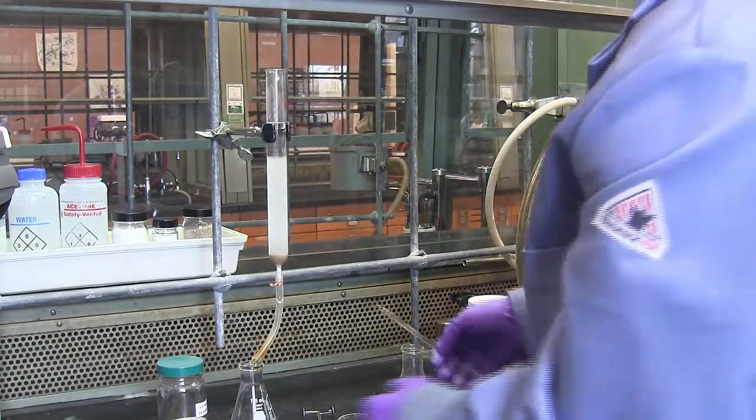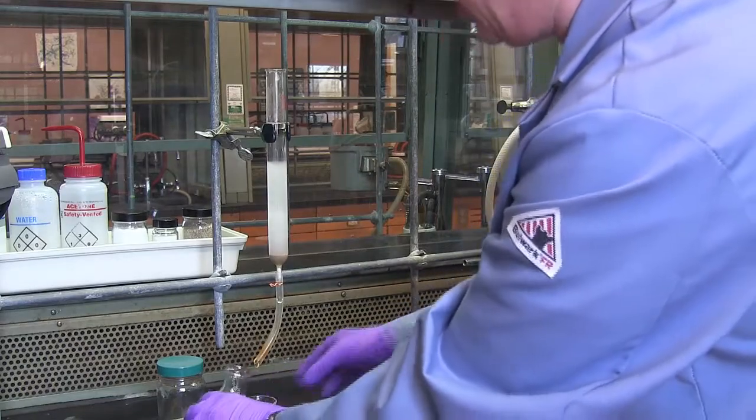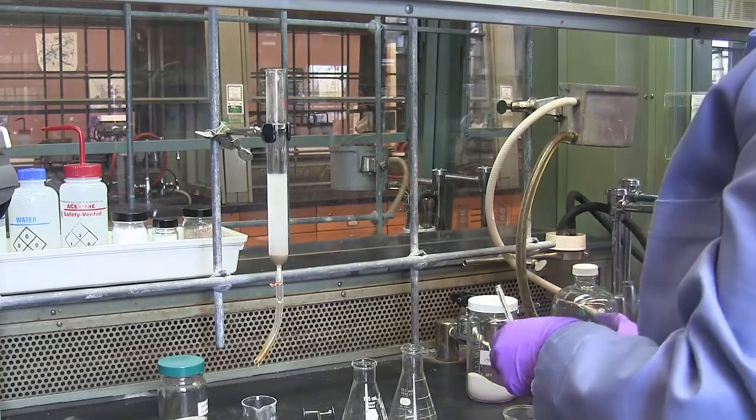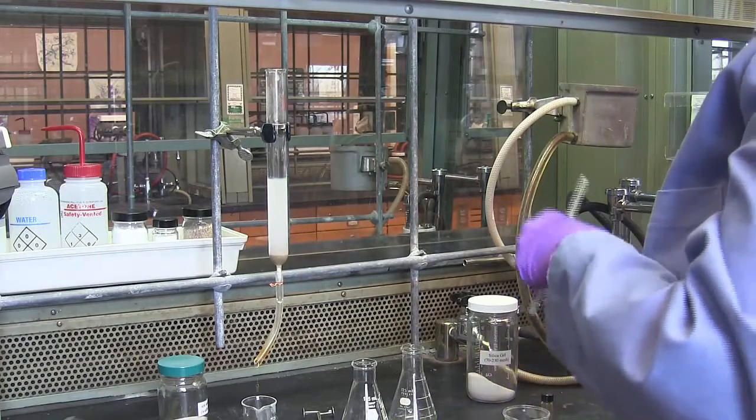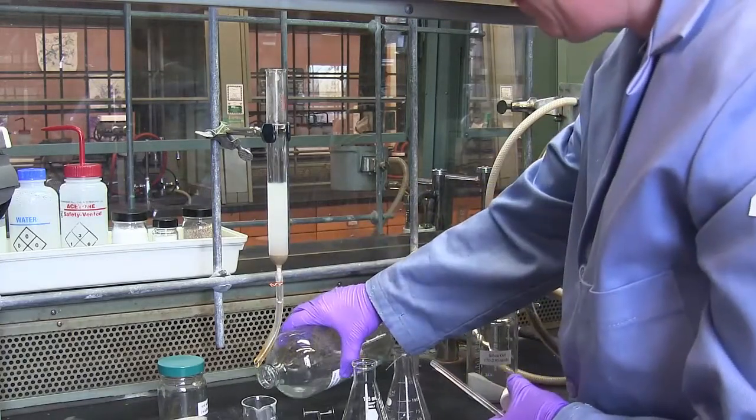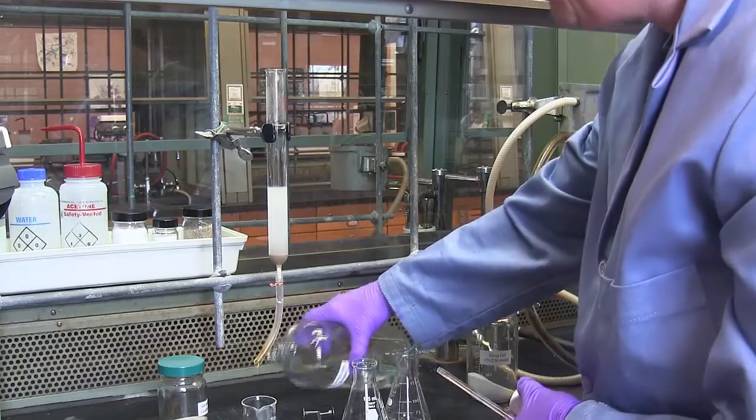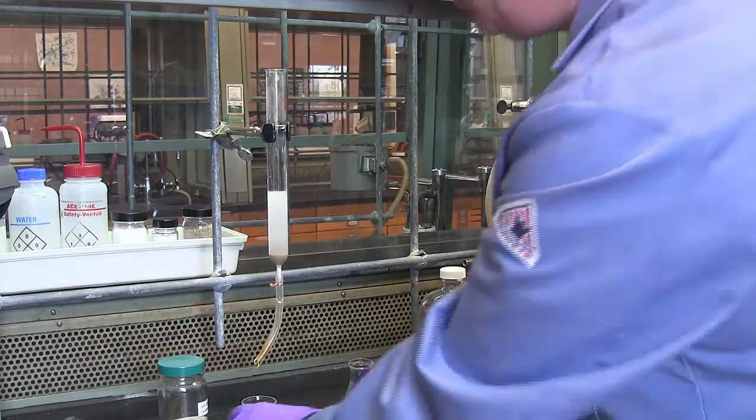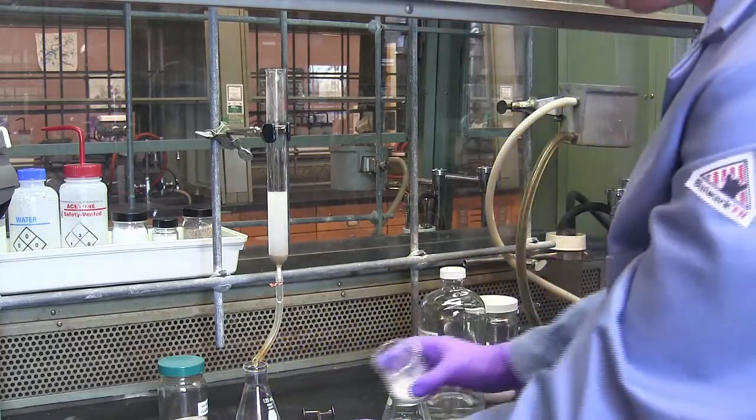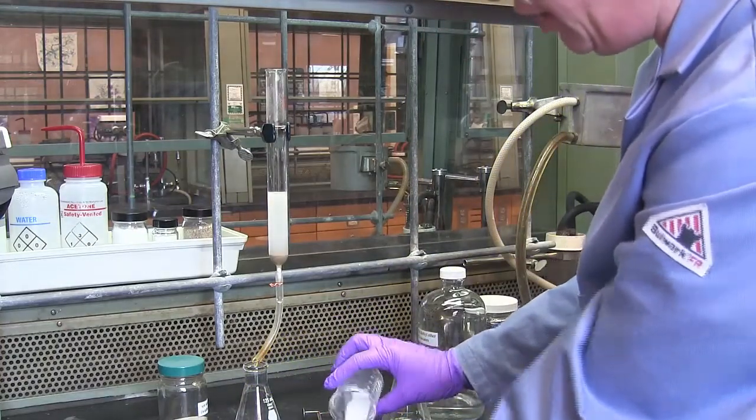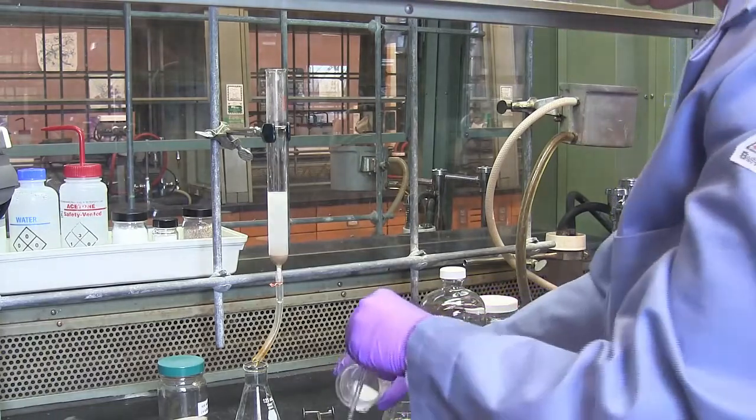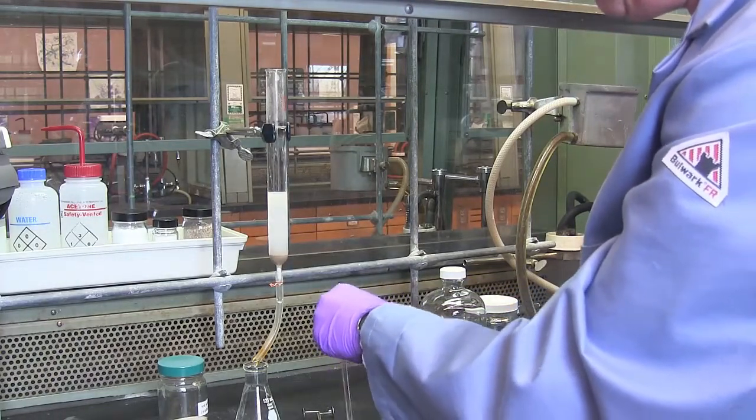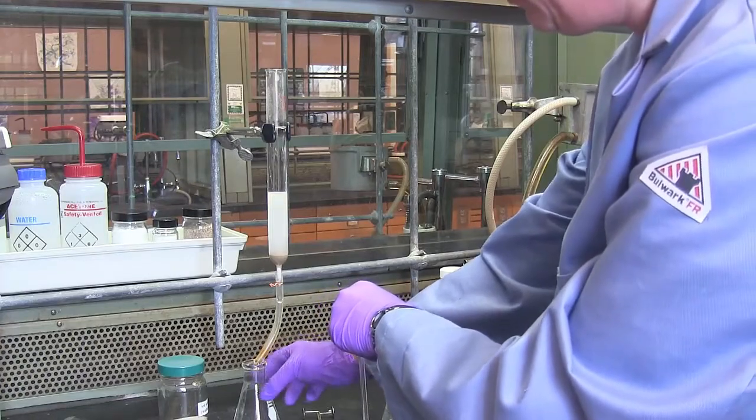You can certainly recycle any of the eluent that drips out of the column, and that is very much encouraged. Once the column begins dripping, try to do your best not to stop the column. Anything that you do that stops the flow will lengthen your lab day. So you want that eluent to continue dripping into the column.